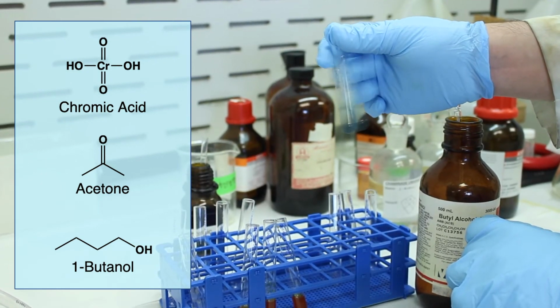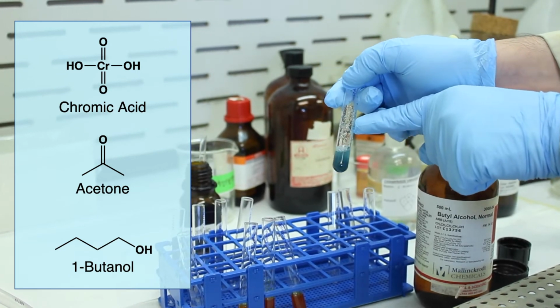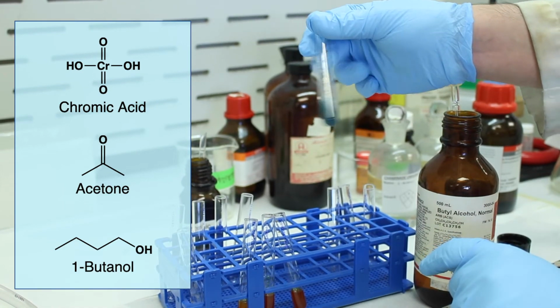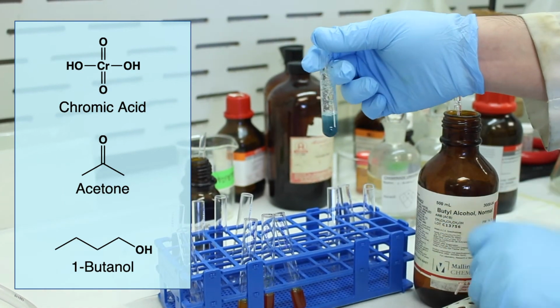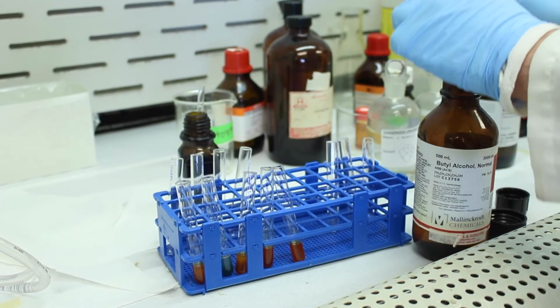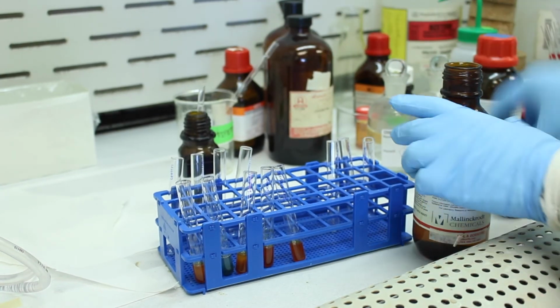And if we agitate the test tube even more, you can see the precipitate. So these are the chromium salts. It's like a water complex with the chromium. And it indicates that this is a positive test result, which we know, right? It's a primary alcohol. So that is n-butyl alcohol or 1-butyl alcohol.